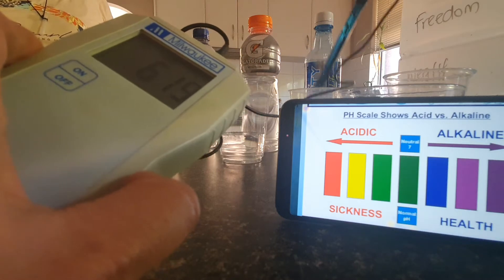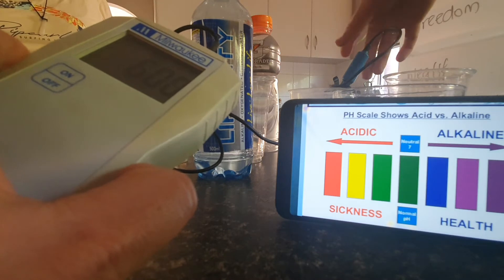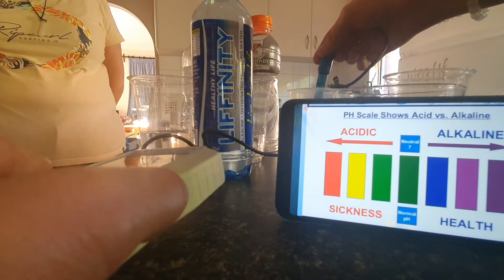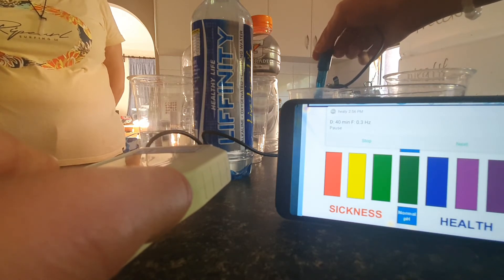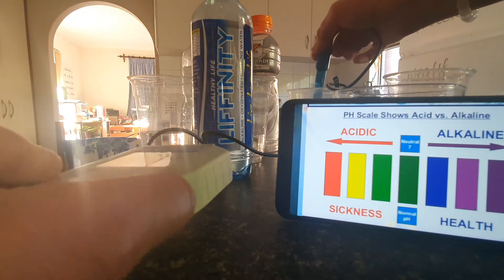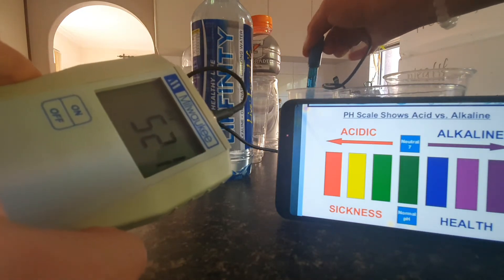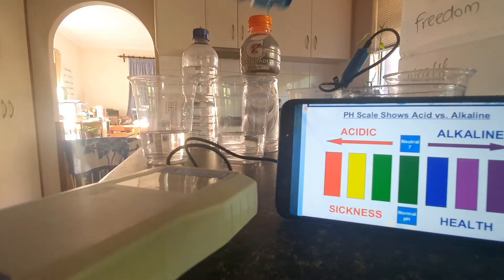And then we've got Infinity — so this is Healthy Life Infinity Alkaline Oxygen-generated drink. And that one's negative. It's dropping, but it's still high negative. Let's see where that one goes. And so this is like the test that we do right before the pH, because once we put the drops in it, we can't use the meter.